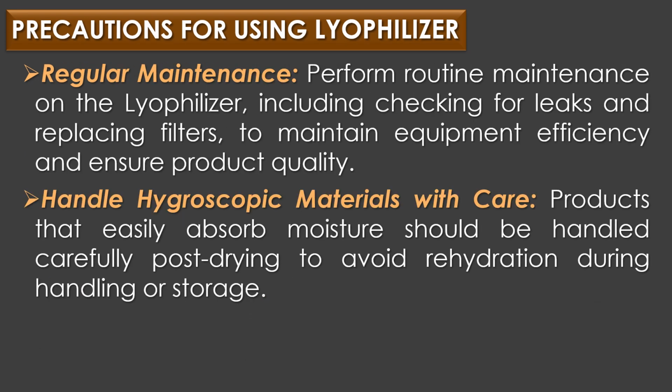Regular maintenance. Perform routine maintenance on the lyophilizer, including checking for leaks and replacing filters to maintain equipment efficiency and ensure product quality. Finally, handle hygroscopic materials with care. Products that easily absorb moisture should be handled carefully post-drying to avoid rehydration during handling or storage.